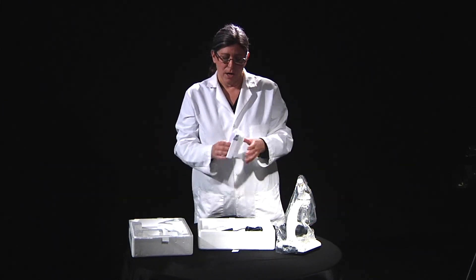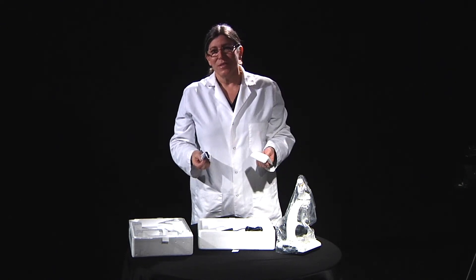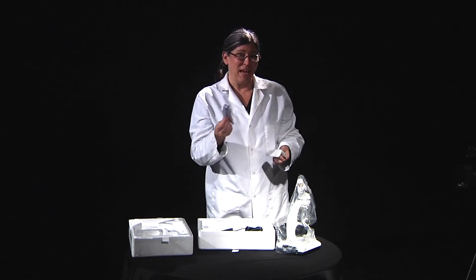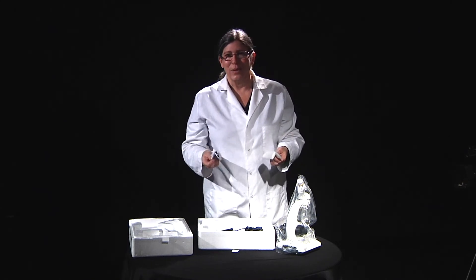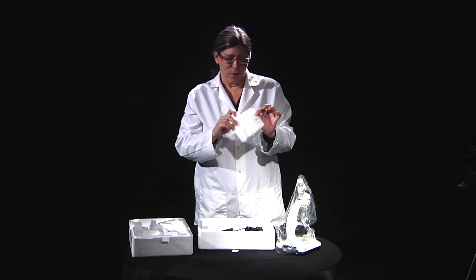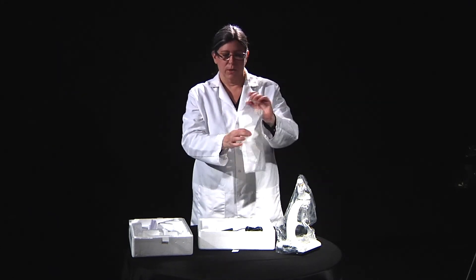Some other things that come in the kit are a set of instructions for how to use your microscope. If you're watching this video, you'll be learning how to use your microscope anyway, but it is convenient to have this on hand in case you don't want to watch this video over again. There's also a dust cover for your microscope — if you need to leave it out for a couple of days, you'll want to have the dust cover put on the microscope.